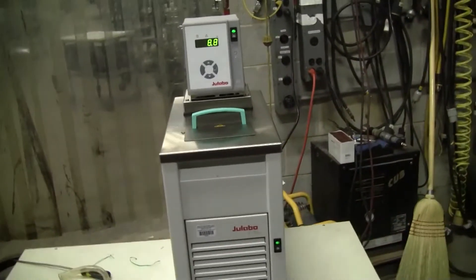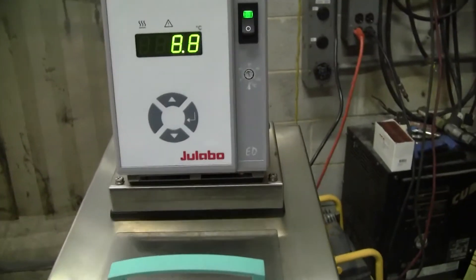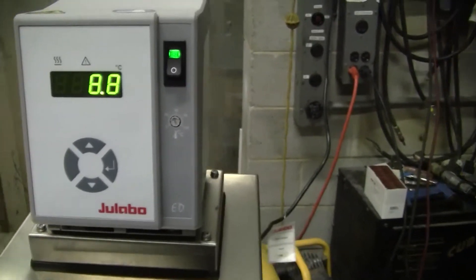Hi, this is Michael Natow from Hi-Tech Trader. Today we're looking at a Julabo F25. This particular Julabo has an ED head, which is the most simplistic head that Julabo manufactures.